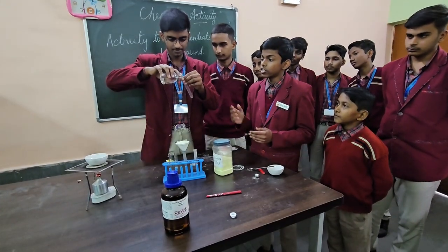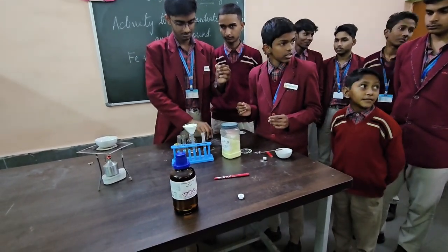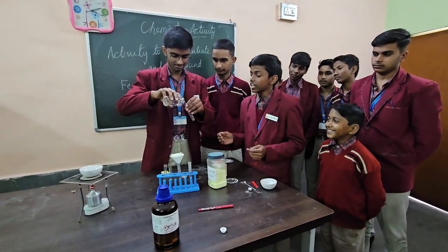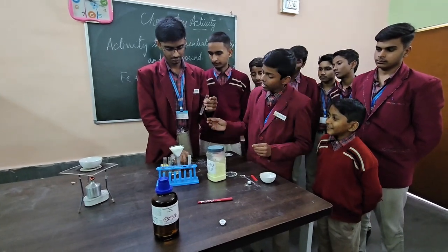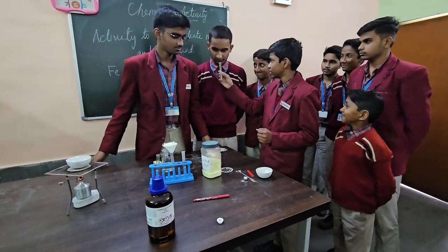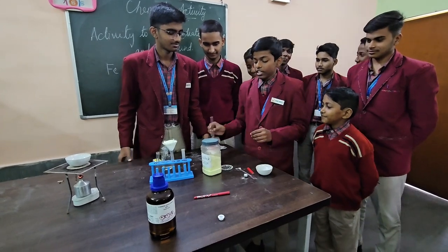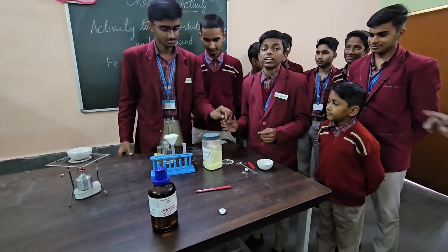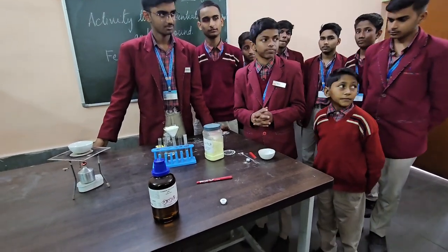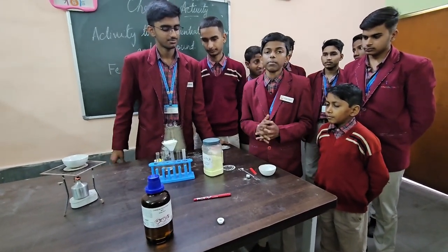When we add dilute sulphuric acid to the compound, it releases hydrogen sulphide gas, which has the smell of rotten eggs and is a colourless gas. So we can conclude that a compound does not show the properties of its constituent substances, and iron will not get attracted towards the magnet.